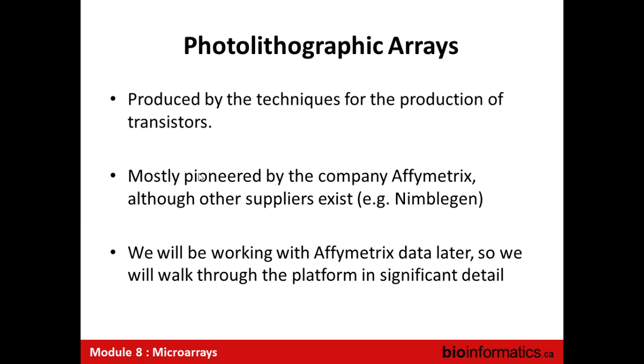You've got a silicon wafer. You shine light selectively in certain parts, and that allows chemical reactions to happen in all of those locations. This was initially done by Affymetrix. There are other companies that do it, and there were a lot of issues around that for a very long period of time that really only got resolved a few years ago.